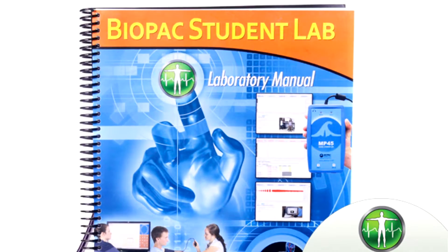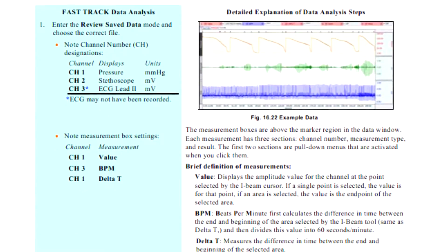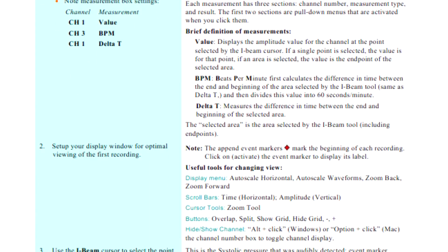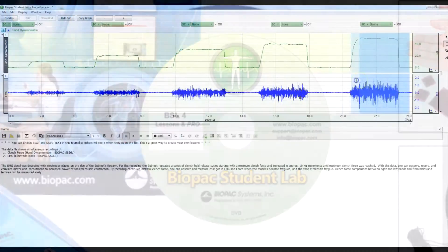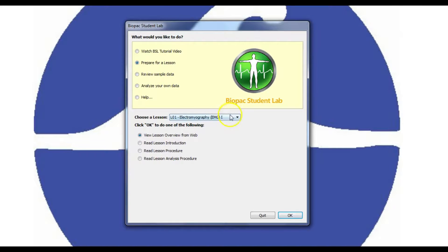The BSL lab manual provides detailed lesson introductions, procedures, and analysis procedures written in conjunction with esteemed professor emeritus Richard Flanzer. Biopac Student Lab software enables data recording, analysis, and sharing. Students can use the free student download to prepare and analyze data outside of class so more recording can be done in labs.